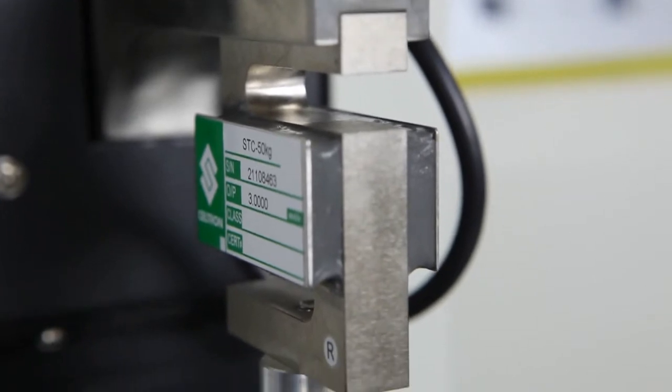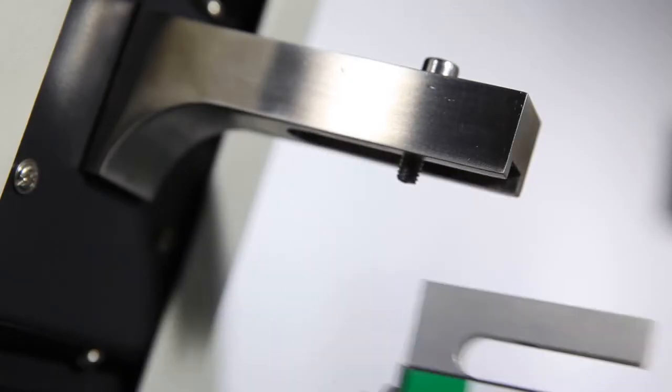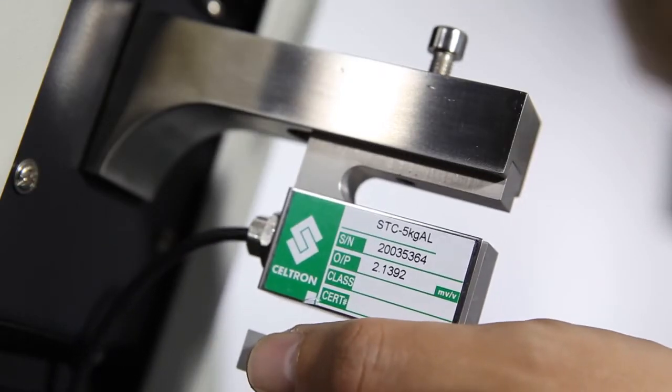The instrument has two load cells, 50N and 500N, which users can easily switch between.